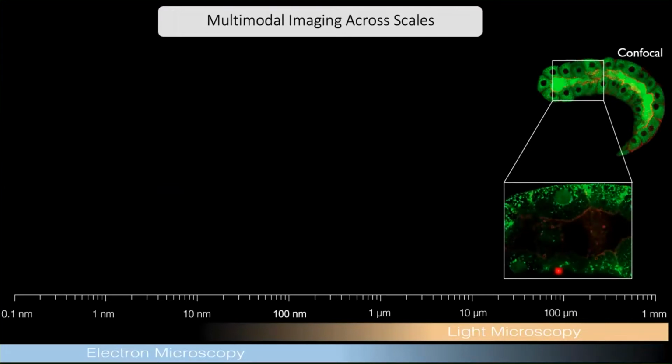So confocal microscopy allows us to look at a sort of slice through a three-dimensional object. These objects can be quite thick, like a tissue. And this optical slicing allows us to obtain quite nice resolution in 3D, however, not sufficient to resolve with high spatial resolution the process of trafficking. Common issues with this is that once a vesicle would pinch off the membrane, it has a huge volume to move through, so we are unable to track the migration of vesicles easily through this gigantic volume.